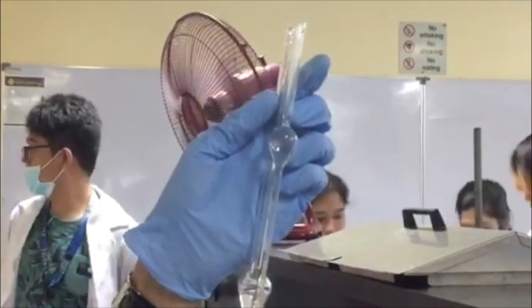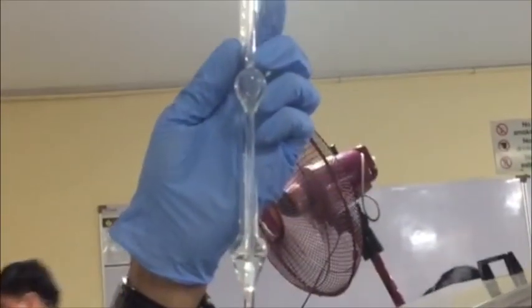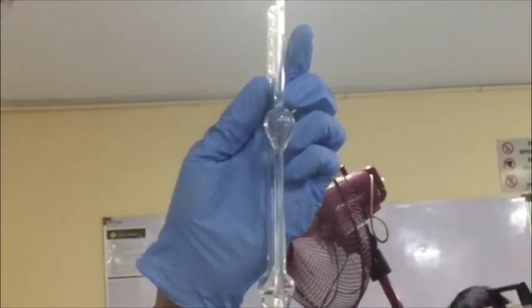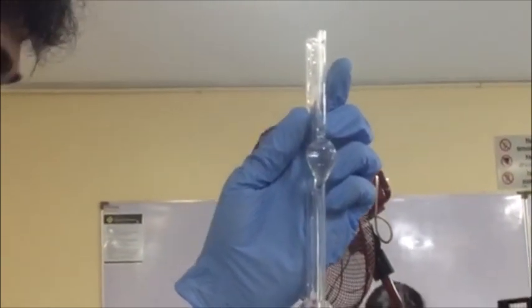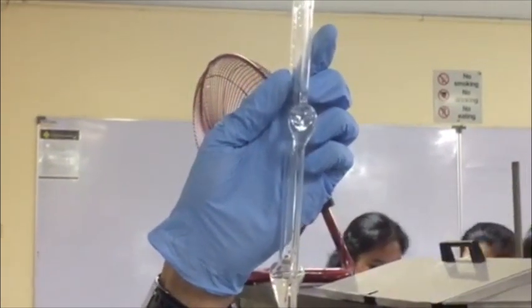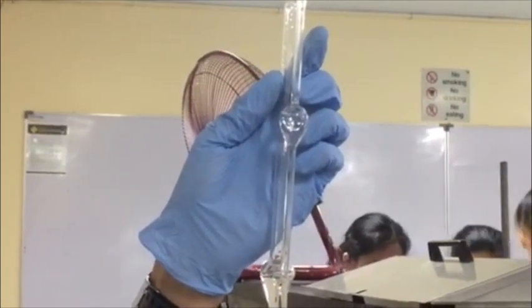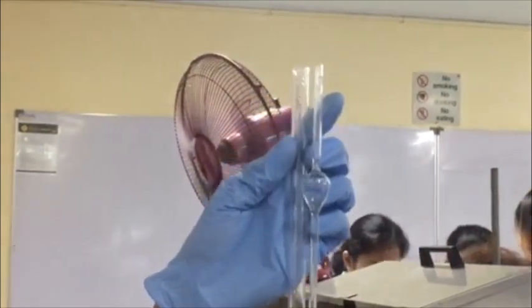Prior to the actual experiment, the viscometer must be calibrated by using a fluid of known density and viscosity as the reference. Doing this calibration will help in the computations involved for this experiment. The calibration of the viscometers is performed by measuring the flow time of the fluid for each viscometer, whose value is equal to the standard calibrated flow time.